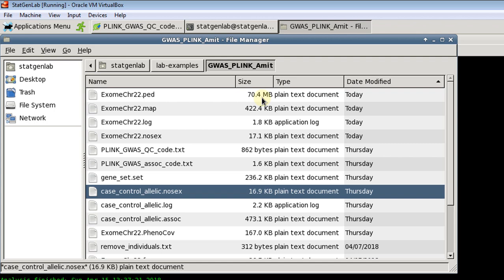So that's why the compressed file format is much more recommended than the text format, because with current data sizes, where we have millions of markers and a few thousand individuals in a dataset, this file can easily go into hundreds of gigabytes. So it's highly recommended to use Plink's binary format, which is much quicker to load and analyze.